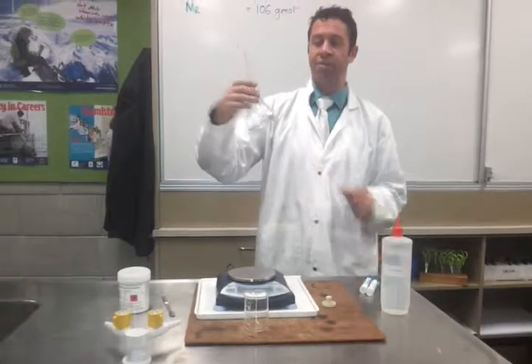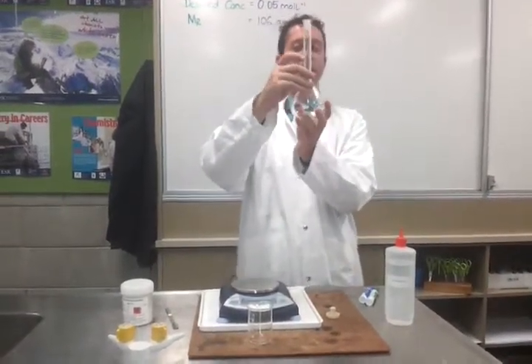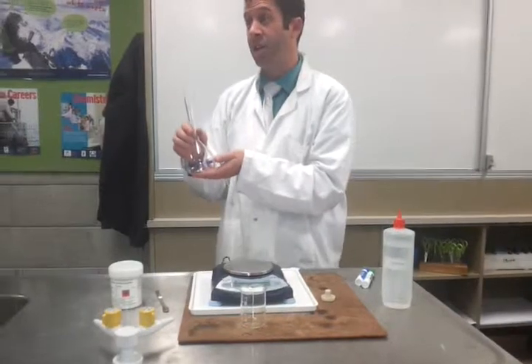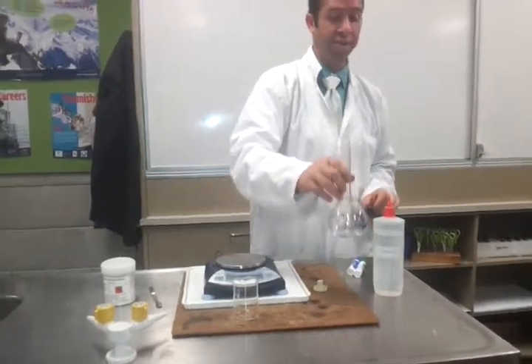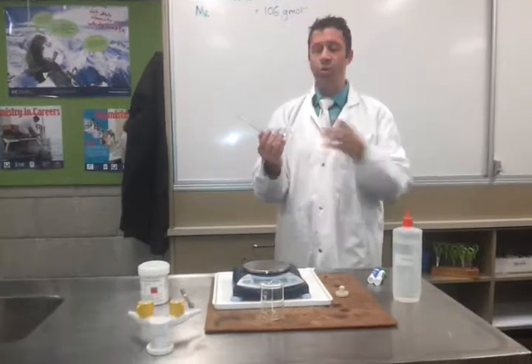This is called a volumetric flask. It's got a very, very thin line etched up the top. That's at 250 mils plus or minus 0.15 mils. So it's really, really, really precise. To 3 significant figures, it is 250 mils. Alright, so these are really precise. Please don't drop them. That's only true at 20 degrees Celsius.